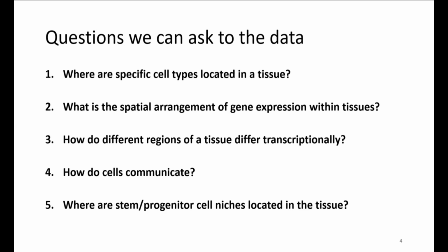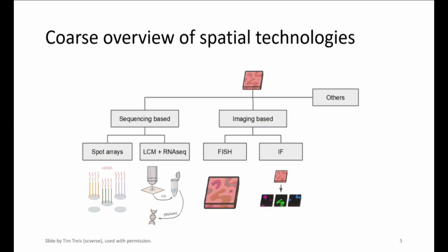It's pretty clear that there are 2 main technologies in the field. We have heard that from Juli, and also from 10x. There are sequencing-based methods, which usually give you a full transcriptome, but a bit less resolution. And there are imaging-based methods, like Xenium or Merfish, for instance, which have even subcellular resolution.